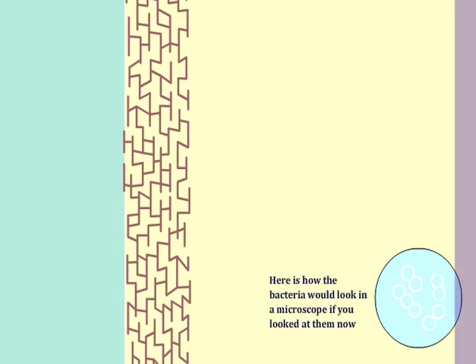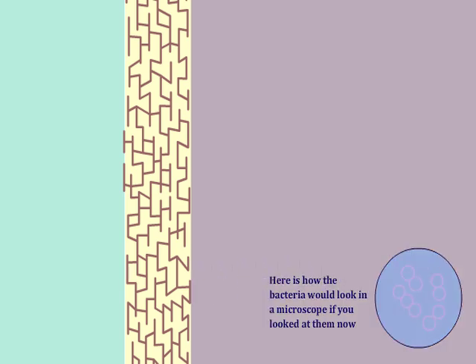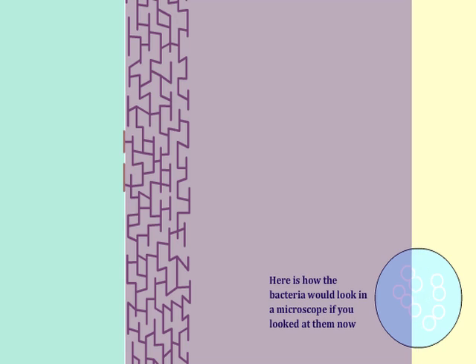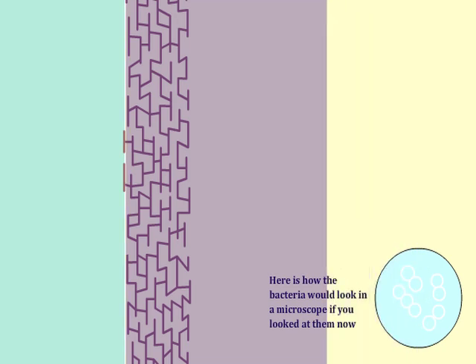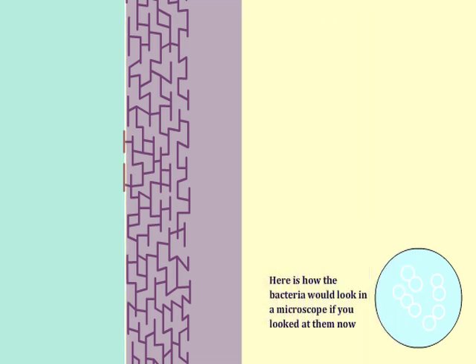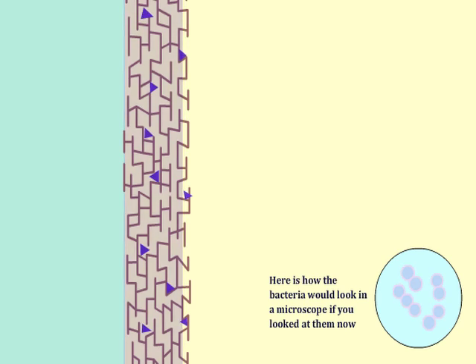After heat-fixing the slide, it is first flooded with crystal violet for one minute and then washed. The stain colors the bacterial cell wall blue, and the bacteria would appear blue in the microscope if examined at this point in the procedure.